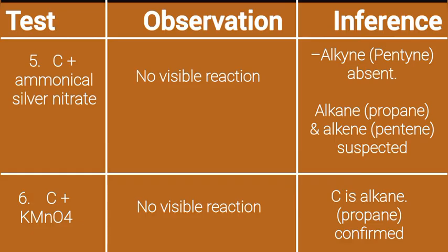So dear friends, this is how we can describe the confirmation of hydrocarbons in the laboratory, which is an alkane, propane according to our instruction, which is an alkene, pentene according to our instruction, and which is an alkyne, pentyne according to our instruction.